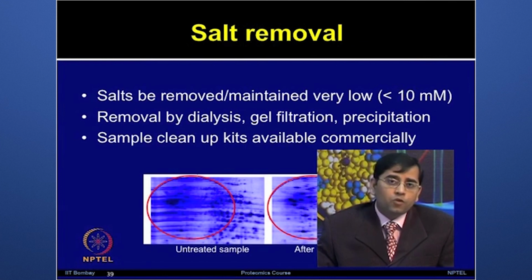There are different types of commercial cleanup kits also available, and since they avoid making the samples very dilute, at the end you can obtain a highly concentrated sample because you can elute your sample in a very small volume. These commercial methods are also very efficient.